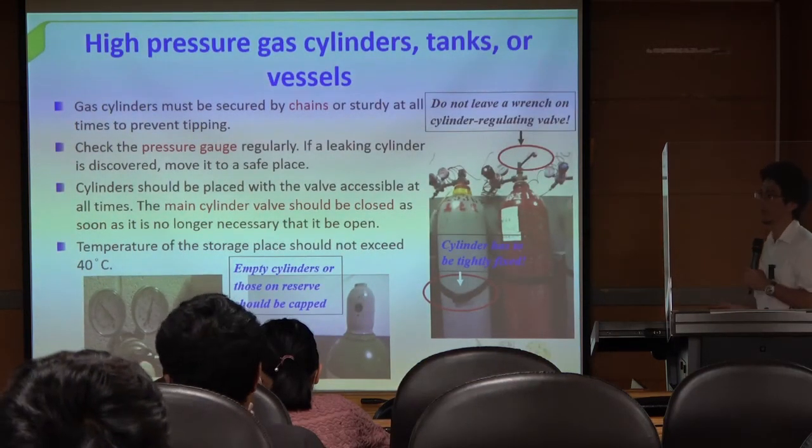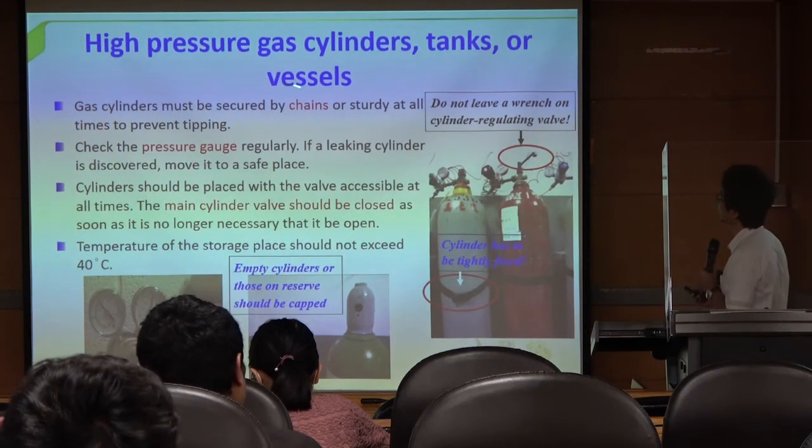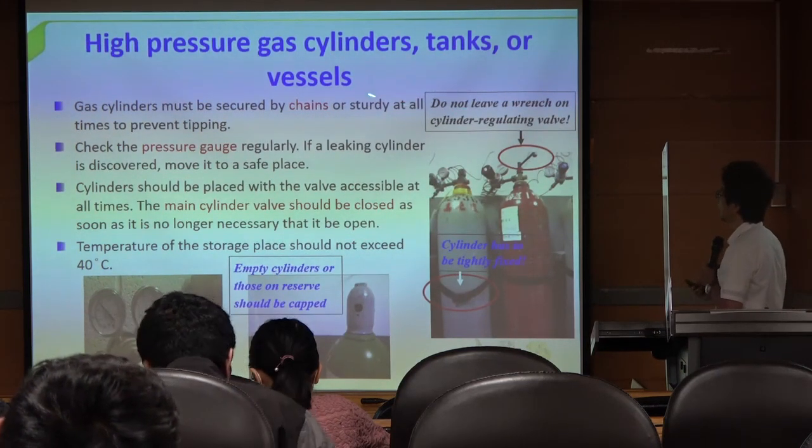Okay, so the last part is this one. The fourth part of the hazards I mentioned is the high pressure gas cylinders, tanks or vessels.